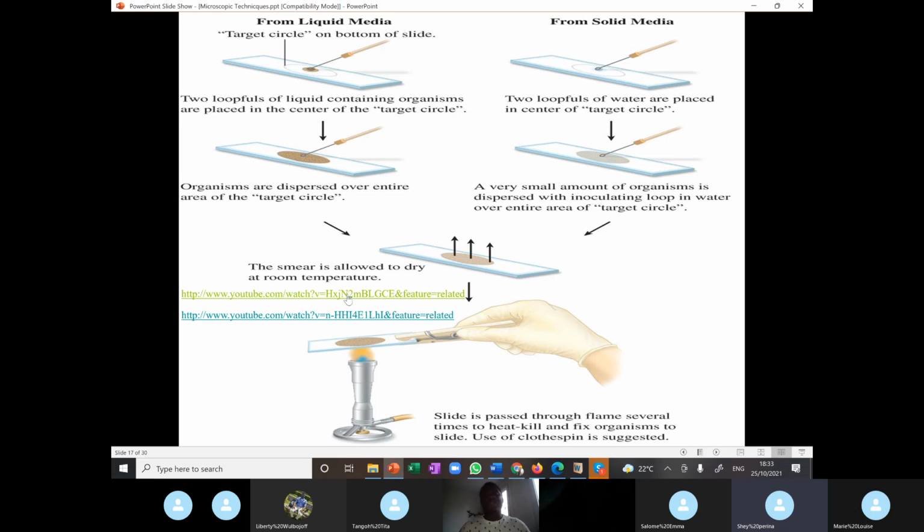So these are YouTube links that you can easily use to visualize it. I'm going to share these presentations with you, so you take your time. You could watch these. They are just 2 minute videos. They're very short to watch, since our laboratory might not be optimum enough to show. I don't have time to be playing the videos now, but their links have been included, so you can play them at your time and visualize exactly what is happening. So when you pass over the flame, you have heat fixed. You can now go on with staining.